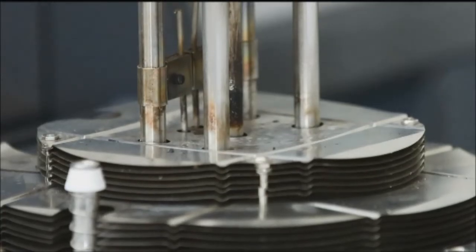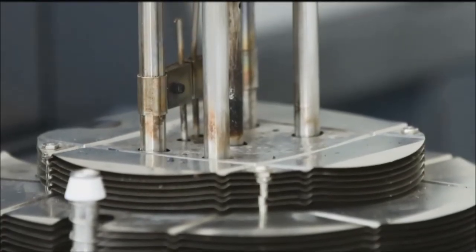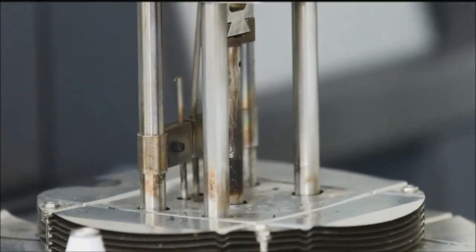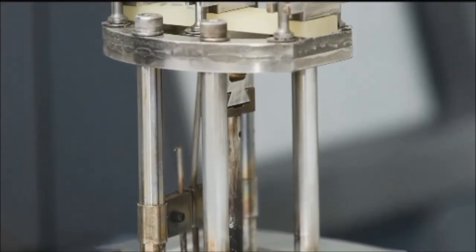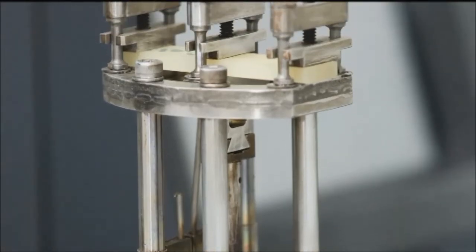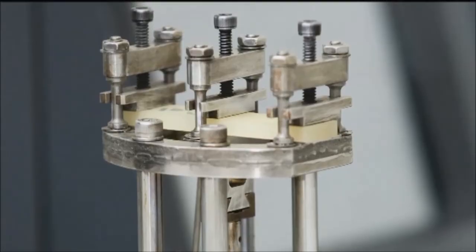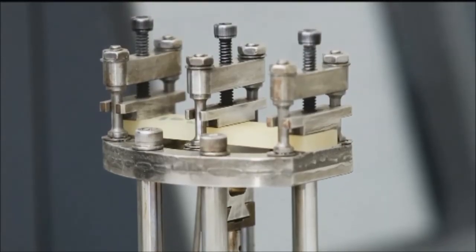The DMA applies force sinusoidally at several frequencies over a temperature range. As the sample deforms, displacement is automatically measured. The magnitude of the applied stress and the resultant strain are used to calculate the stiffness of the material under stress.